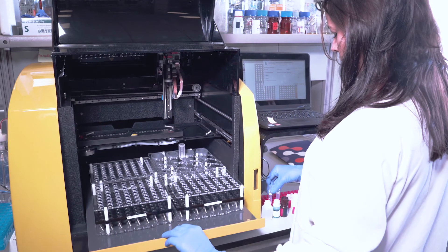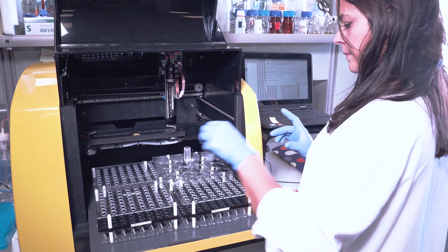Load the gluten program. Select the samples and the corresponding dilutions.